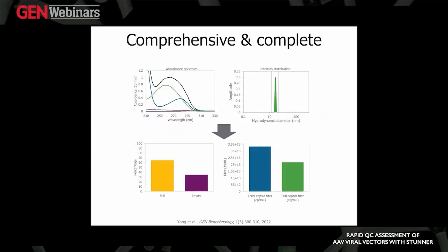When an AAV product is pure and stable, the composition dictates its specific optical behavior. For example, given absorption of light and given scatter, the combination of all these products is kind of an optical signature unique to that AAV product that you made, that can be used to monitor for consistency in the performance of GMP manufacturing runs. Especially when more resource-intensive assays are being performed. So if you get the answers that you've historically gotten across these different optical measures, then you know that you're producing the same product.